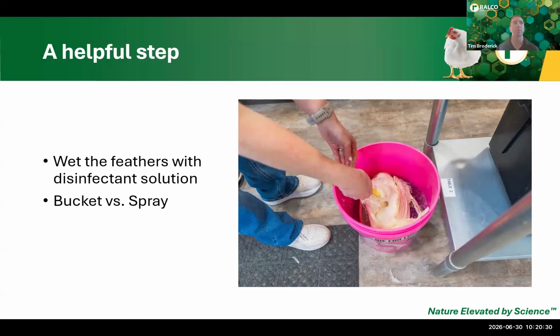Additionally, it helps us with how we actually examine those birds. Aaliyah just gave a great outline of what to look at when you have live bird specimens, but their appearance can change once all that feather is matted down. It creates a cleaner environment for us to work with. We can get more precise cuts. There's less dust, and it gives us, again, another layer into examining the outside features of that bird before we then go and start cutting in.